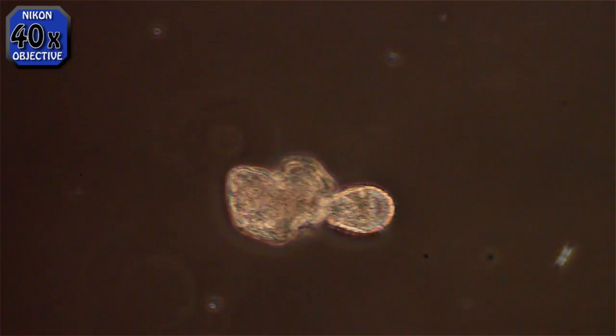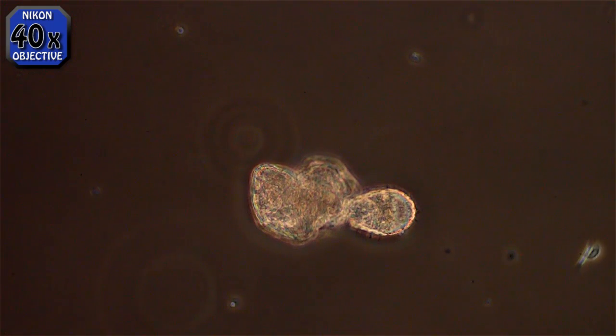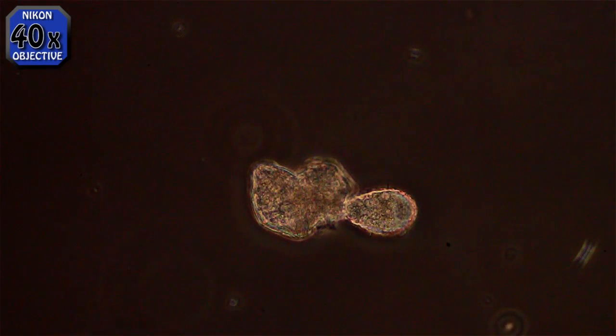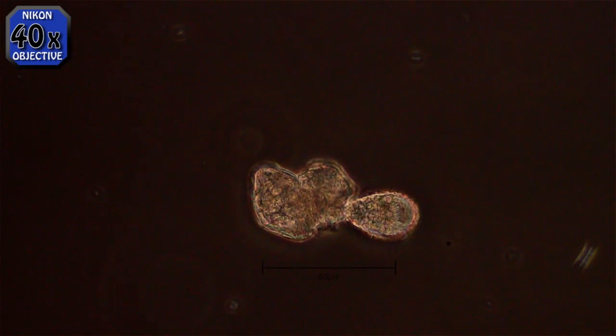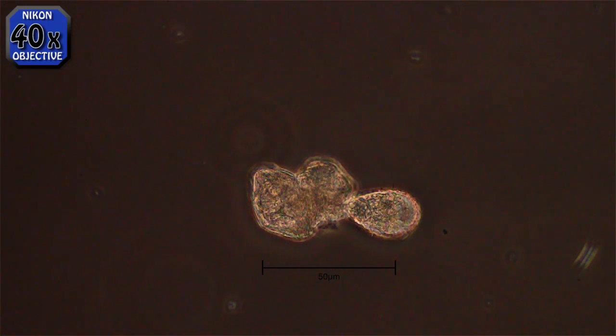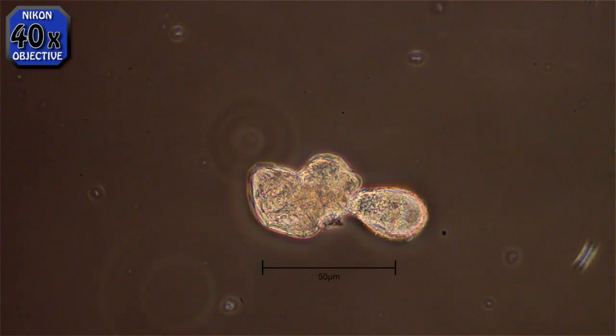This is a euglipha. I don't know what subspecies it might be. I very seldom find one that is obviously alive — most of them are just empty shells when I find them through the microscope. They're not very big. I have found a few of different species, with obviously different shaped shells and color. But this is the first one I've ever seen in eating mode.